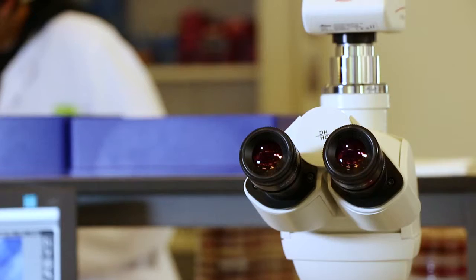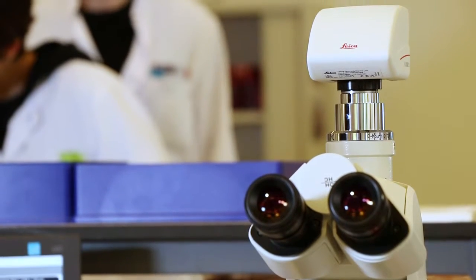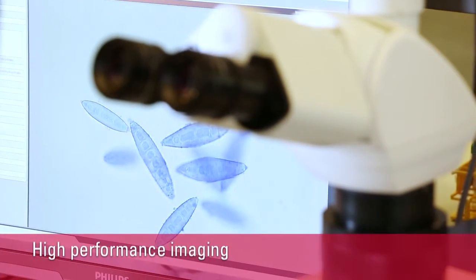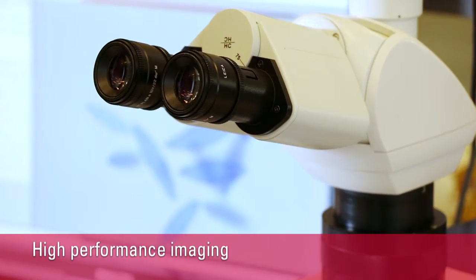I work at the STAR-MBC Rotterdam. It's a laboratory that does work for GPs in the region and my occupation is a lab technician for microbiology. I work with fungi and usually we draw anything we see under the microscope. Now we make pictures of the fungi and the yeasts we see under the microscope.